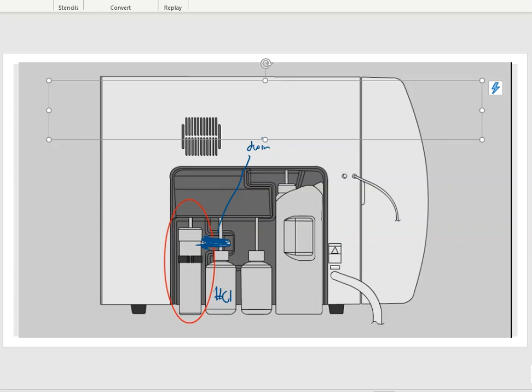Here's the weird thing about this, though. The reason that I'm pointing this out is that this drain pot, and that's how the schematic labels it, that's what we'll also call it, has to be filled in order for it to work the proper way. I know that sounds kind of strange, but in order for this TOC machine to work, and in order for the dehumidifier to work properly, we really do want that drain pot filled all the way to that drain level, or the sidearm, with DI water.